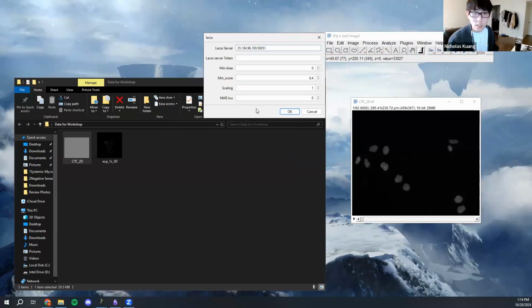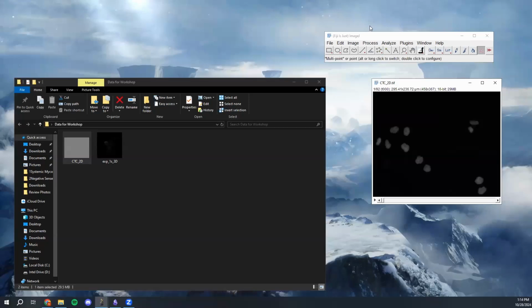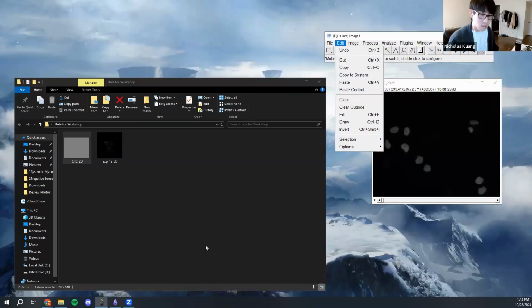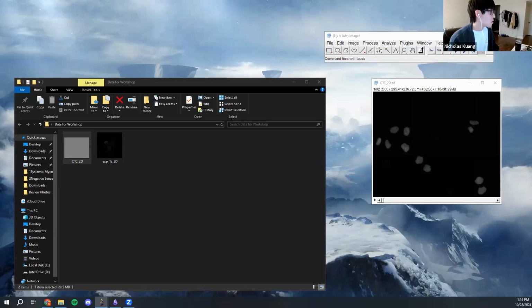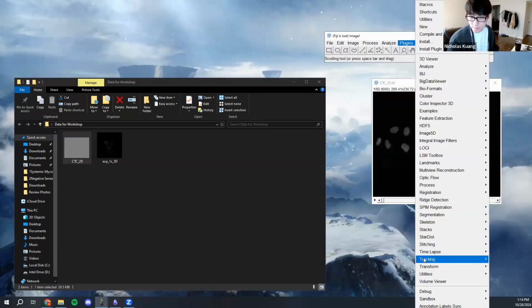Oh, so the IP did change. The alternative server might be down, Dr. Yu. No, I don't think so. You sure? Yeah, I think it's down. All right, so unfortunately, that one might be. Okay, so can you connect Mantis? Yeah, I'll use Mantis.